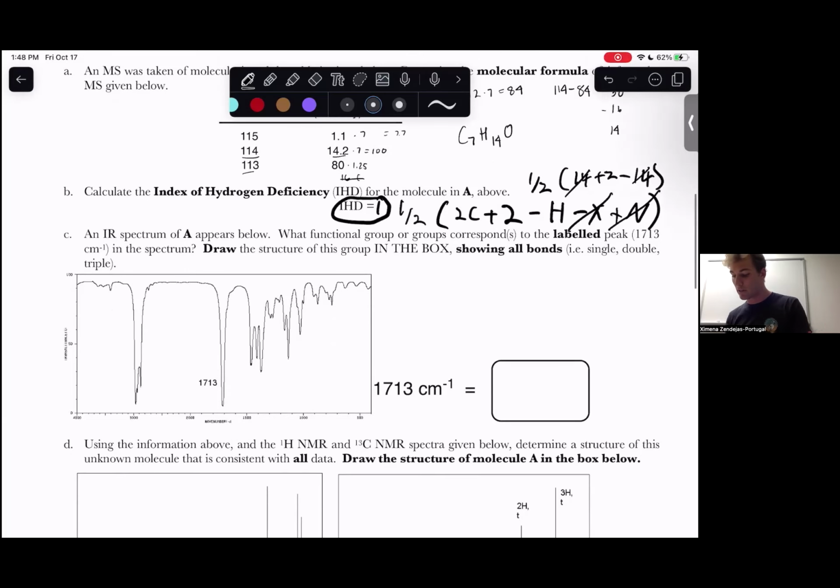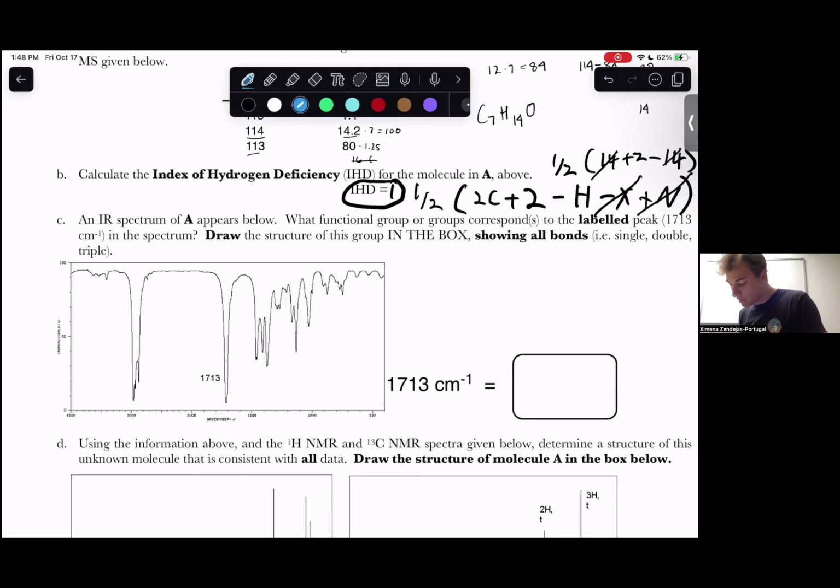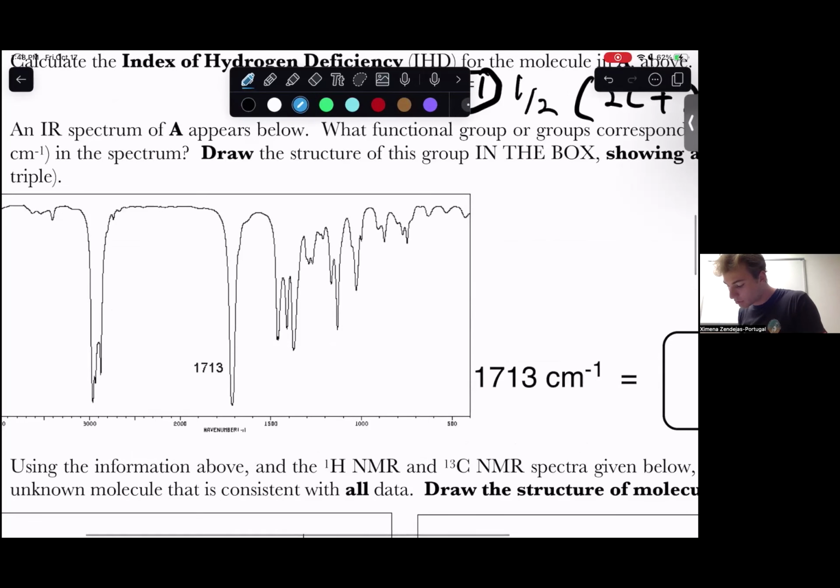And now for this next part here with the IR spec, let's go blue. This is going to be our range where we're likely to see a double bond appear. So we see that there's this little peak here, and it's very prominent. So it goes pretty far down.